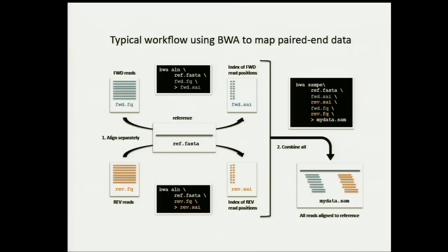It's just an alignment file. And then you use this SAI file with the BWA SAM-PE. PE meaning paired end. There's also the single end. If you're doing paired end sequencing, you will do that first step twice for both mates. And then you will have two SAI files, as we see in that diagram there. And you can run them both together with SAM-PE to generate the SAM file. A SAM file is just the BAM file, but not binary. It's the original alignment format.